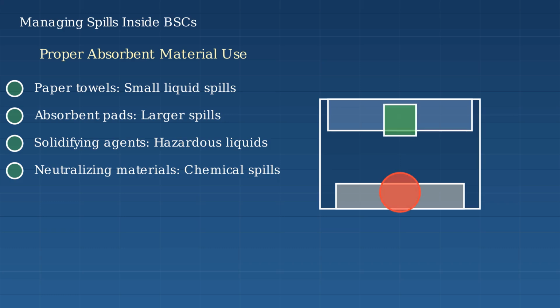When using absorbent materials, work from the outside of the spill toward the center to prevent spreading contamination. Allow sufficient contact time according to your disinfectant specifications.